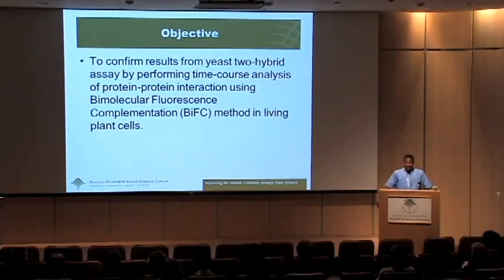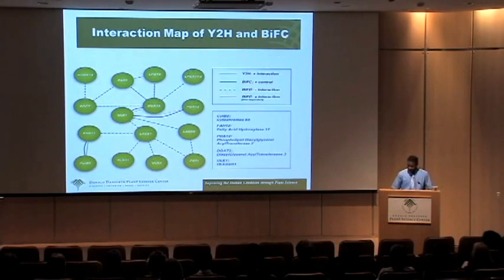So the objective of my research this summer is to confirm results from the yeast-2 hybrid assay by performing time course analysis of protein-protein interactions using bimolecular fluorescence complementation in living tobacco cells.